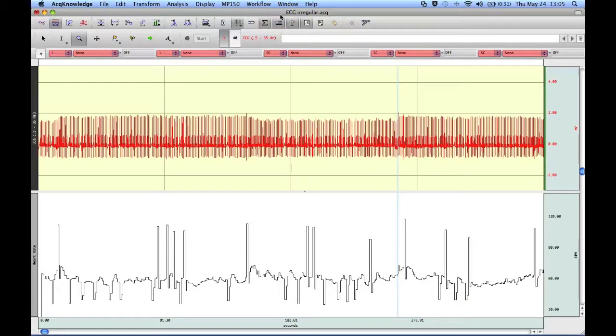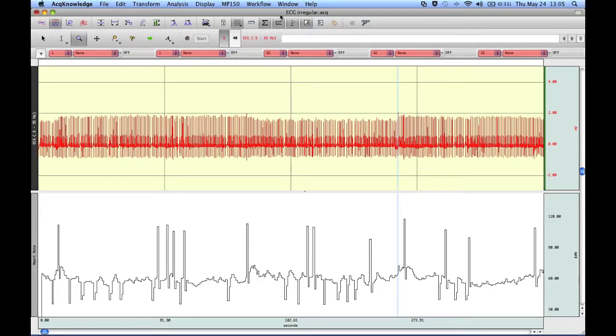The following screencast will provide a demonstration of Achnology's Fine Cycle Peak Detector. This is part 6 in the series, and this particular screencast will demonstrate the clustering output option.